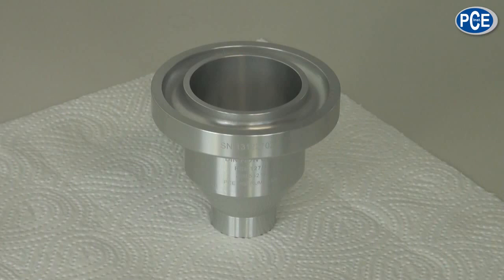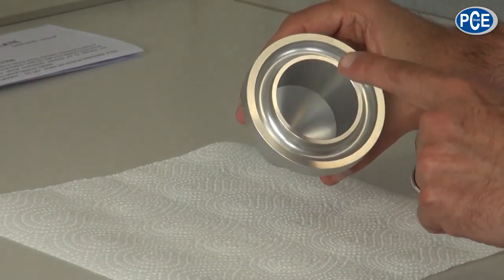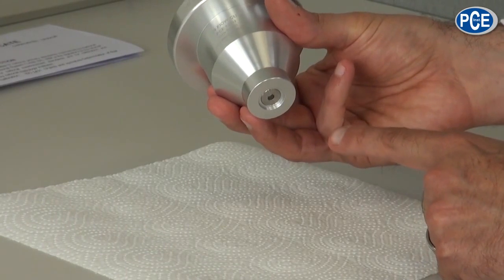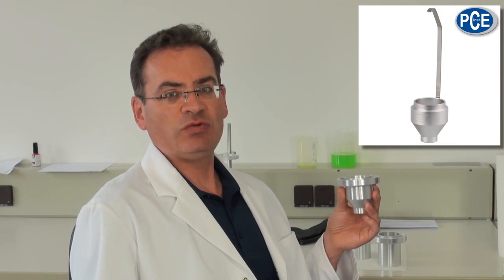The Flow Cup has a volume of 100ml. On the top it has an overflow rim and on the base an outlet nozzle. The DIN Flow Cup 127 is available as overflow and pot versions. It has a fixed nozzle of 4mm.